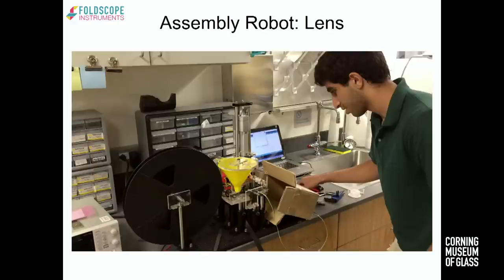So one thing on a production level, and this is the old version. I can't show you the new version of production because not everything is entirely in place yet. But this is how we used to make microscopes, in the lab at Stanford, all with homemade robotics. The paper itself is pretty easy to cut, but some of the apertures and the plastic pieces that hold the lens in, and that also hold the magnets in, are harder. The magnets are what attach the phone to the Foldscope. These processes are all made in the lab with this reel-to-reel manufacturing method. And you maybe saw a snippet of this earlier, but this is the lens machine at work.